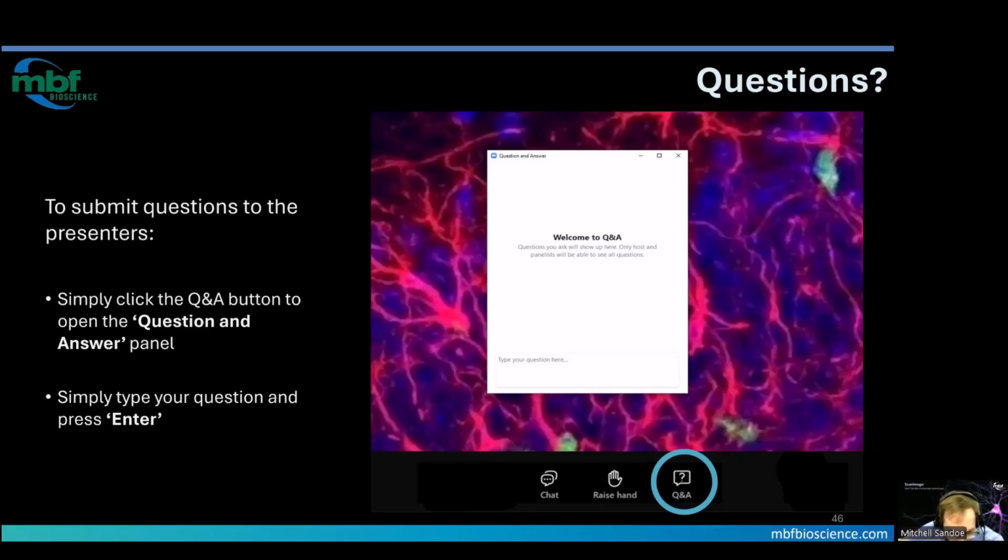I guess I like this question about tiling. It says, I am wondering why mosaic tiles need to have their size and resolution specified. Is it not possible to match the field of view from focus and simply move it by specified displacement in X and Y? I like that idea. Just not the way we did it, but it could be easy enough. Make a drop down for different modes of specifying those types.